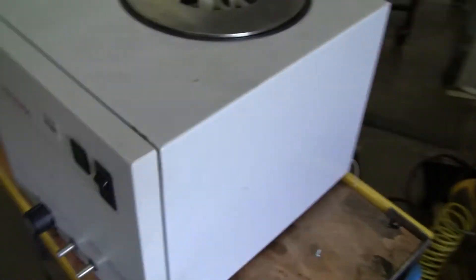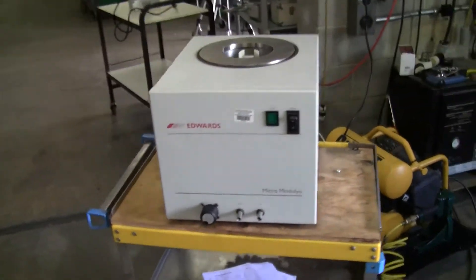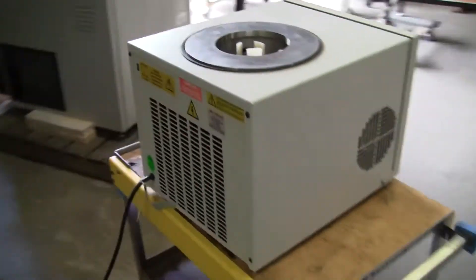In here it's running nice and quiet. This is a nice clean piece — it looks like it's almost brand new actually. There's a little fan, with a little exhaust going on there.